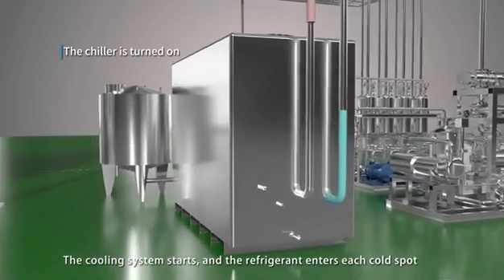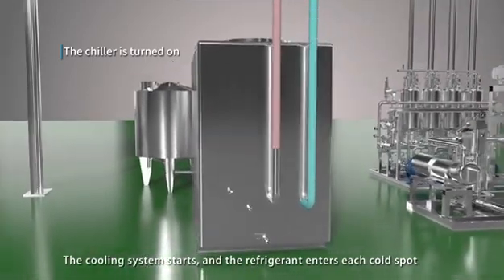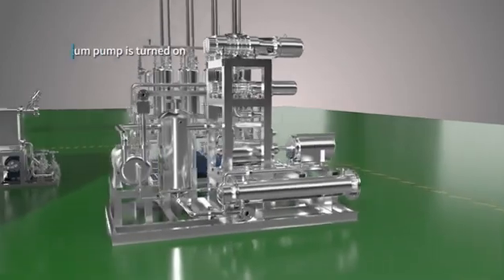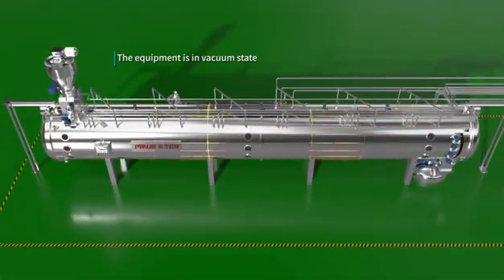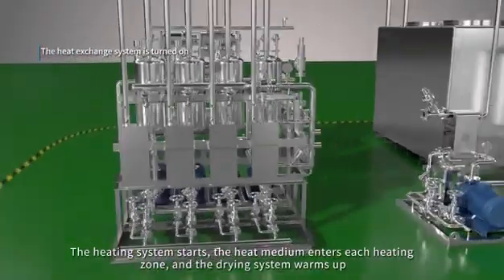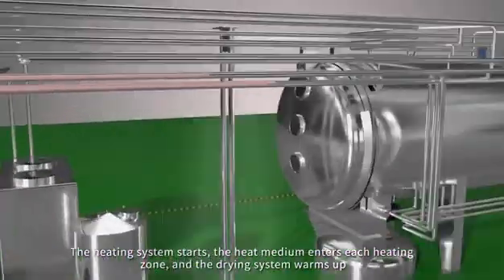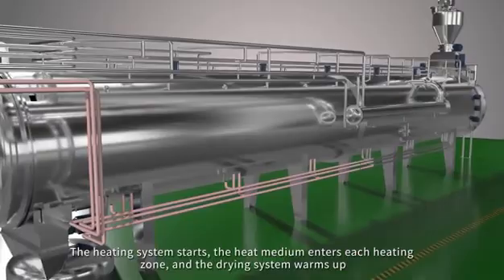The cooling system starts and the refrigerant enters each cold spot. The vacuum system starts and the main body is pre-evacuated. The heating system starts. The heat medium enters each heating zone and the drying system warms up.